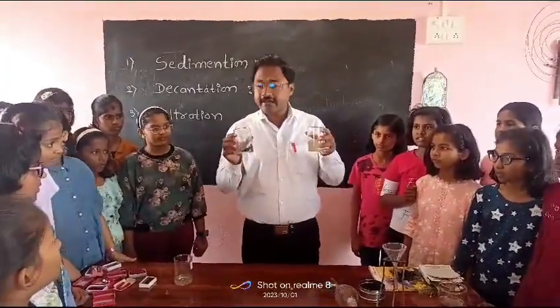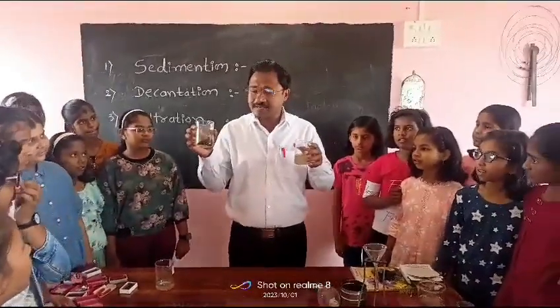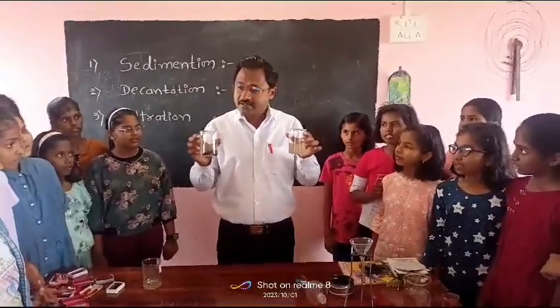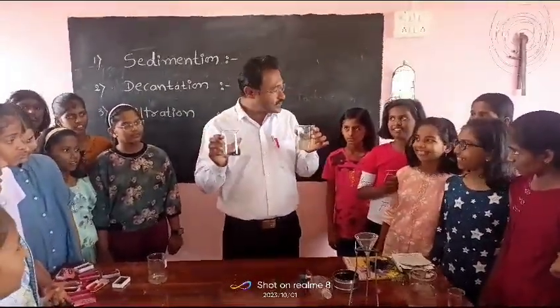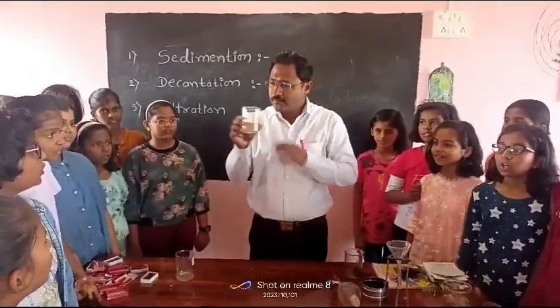Now what can we see here? We can see the sedimented substance, which is sand, is separated from water. This method is known as decantation.